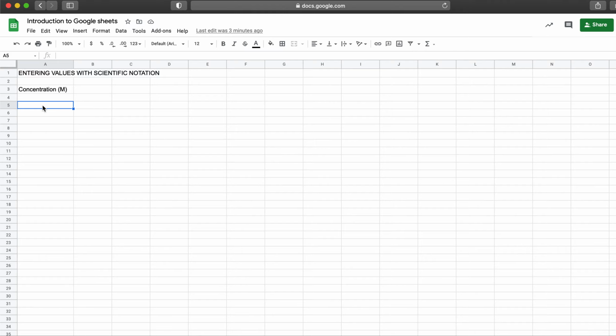Lecture video to walk you through some common ways in which we use Google Sheets in chemistry lab. So one of the things that you would want to do is enter your values into the Google Sheets. And as an example here, I have concentration values that I want to enter.